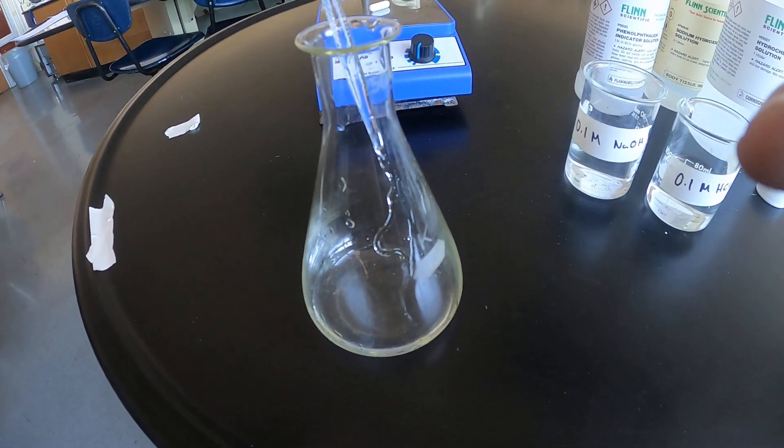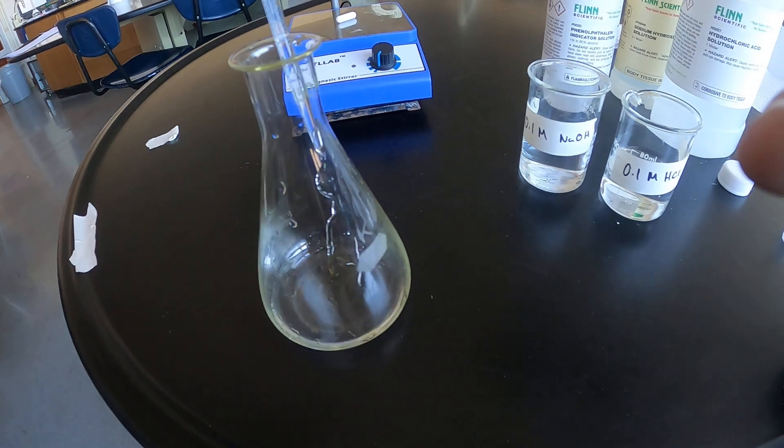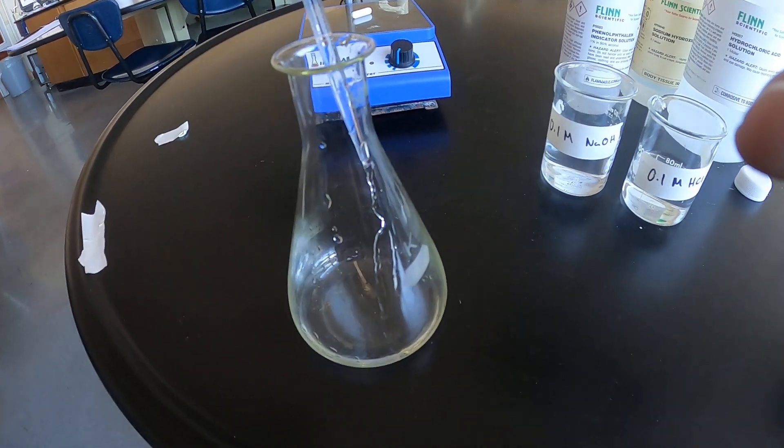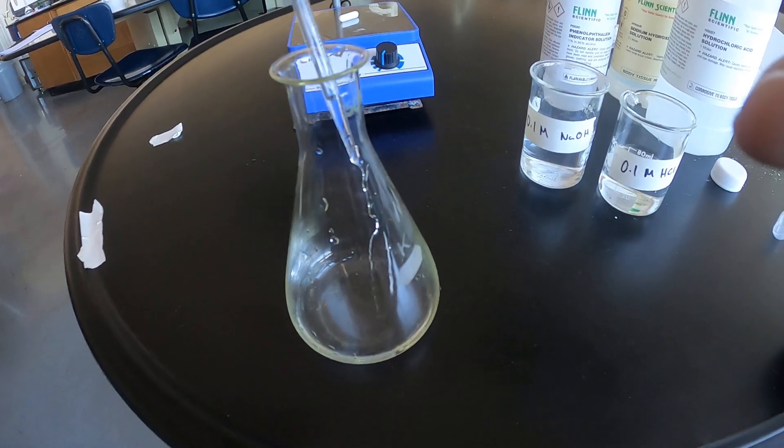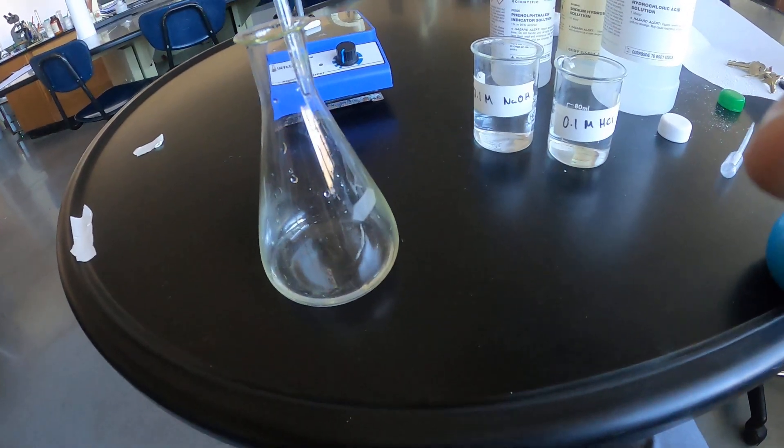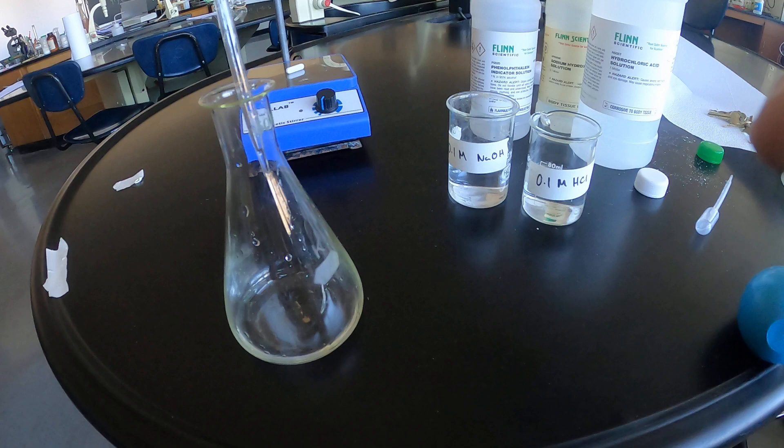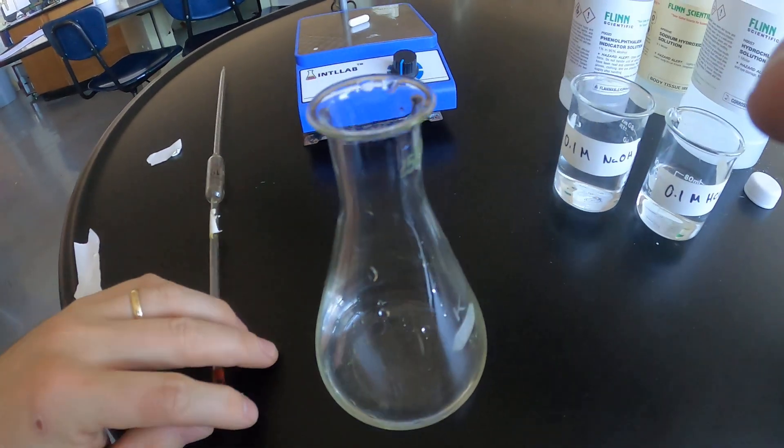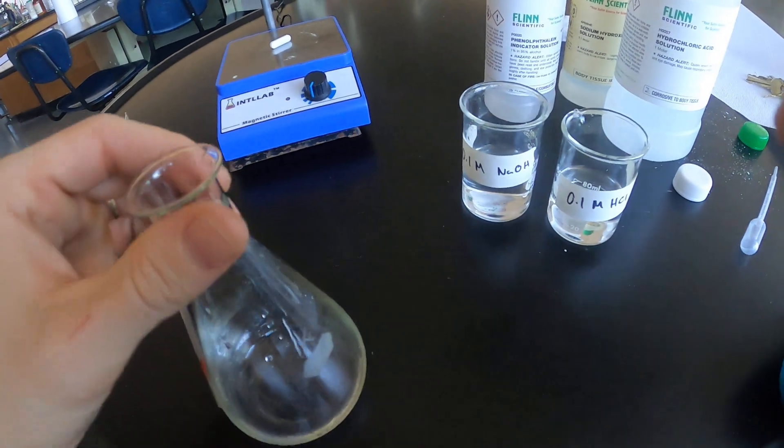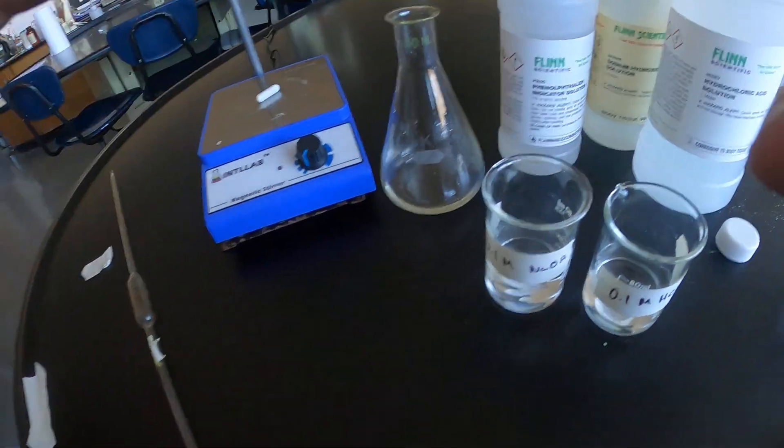In this lab you might share materials with the neighboring group. Could be the stir plate, could be the volumetric pipette, the bulb, so we're just going to share. If you're sharing, two people take a determination then you switch while the other group takes a determination if they are indeed running the experiment on that day.